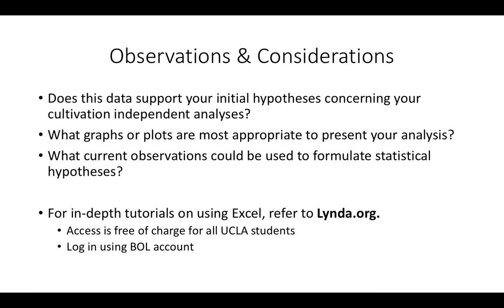Before I conclude this video, I leave you with some observations and considerations. Consider how this data could either support or refute your initial hypotheses concerning your cultivation-independent research. Consider what graphs or plots are most appropriate to present your analysis. Also, what current observations could be used to formulate statistical hypotheses that could be tested later?